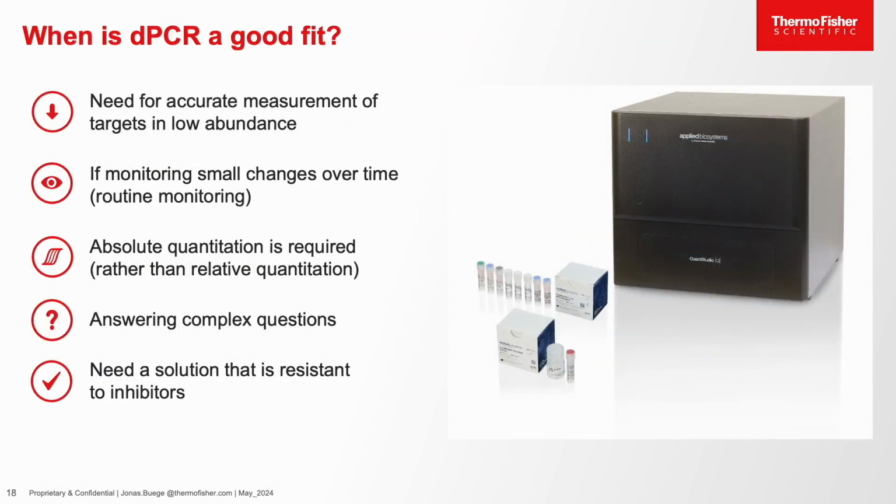So now the question is, when is digital PCR a good fit? In general, for targets of very low abundance, also for monitoring small changes over time. Also when absolute quantitation is required, especially in situations where a reference standard is not easy to obtain. And lastly, when you have the need for a solution that is more resistant to inhibitors.